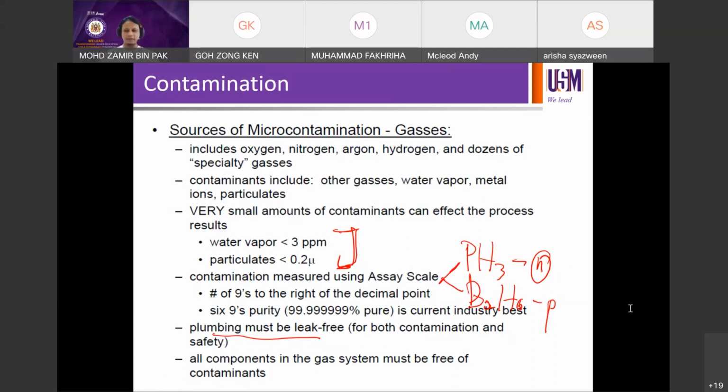Leak sensor activated. Belongs to, say, phosphine. What do you think will happen? Bakaran? Apa you kena buat? What do you think will happen next, immediately, to yourself and others? Lari, lari lah kan. Well, lari is the essence of what you're doing lah, lari.